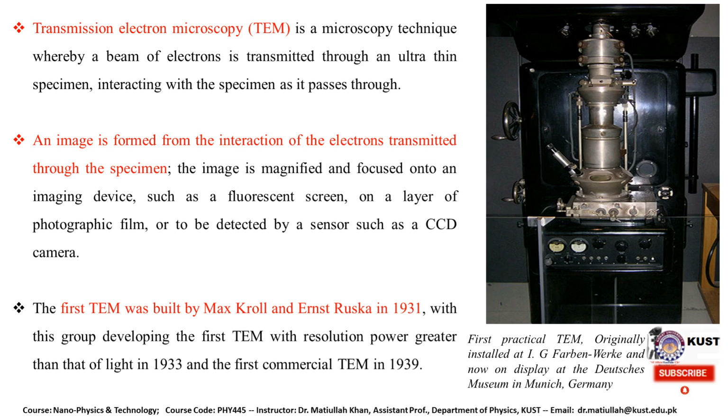This is an image of the first transmission electron microscope that was introduced in 1933, originally present at IG Farben and now displayed in a museum in Munich in Germany.